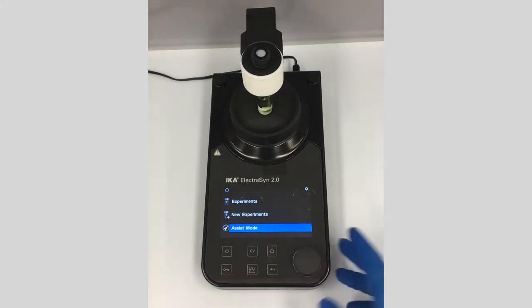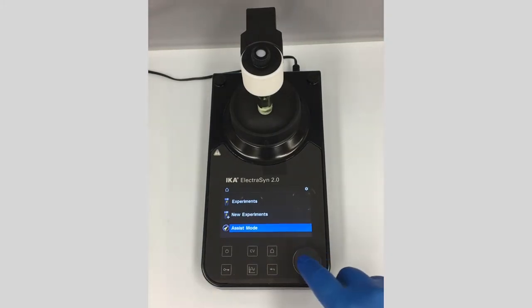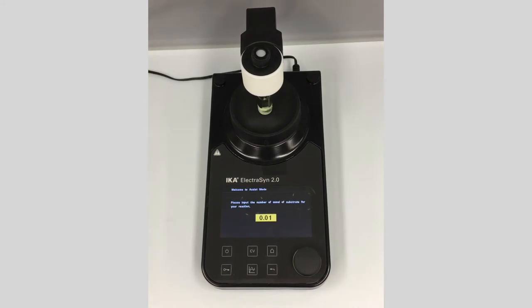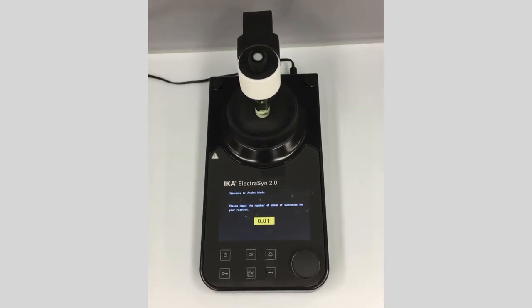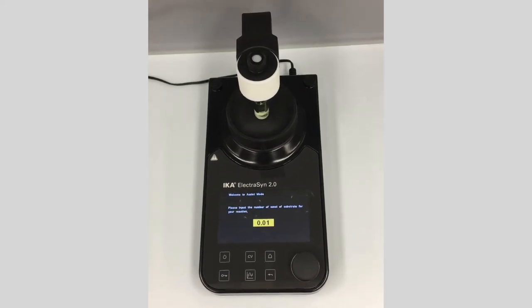So from the home screen, we go down to assist mode and click here. This is really going to give me guidelines for how to run this reaction based on the number of millimoles of starting material and the number of equivalents of electrons I want to use for reductions or oxidations.